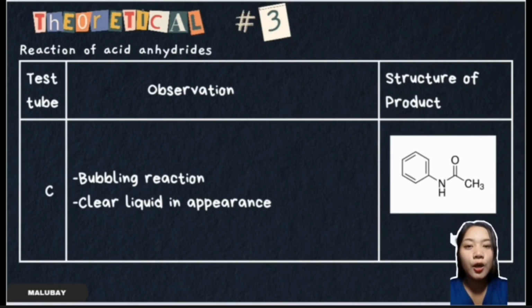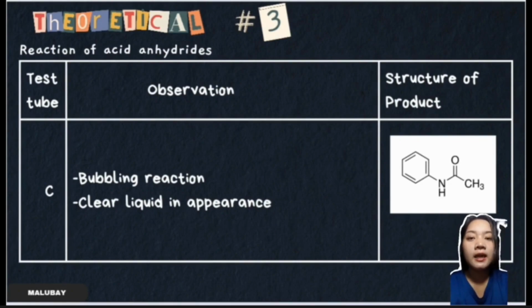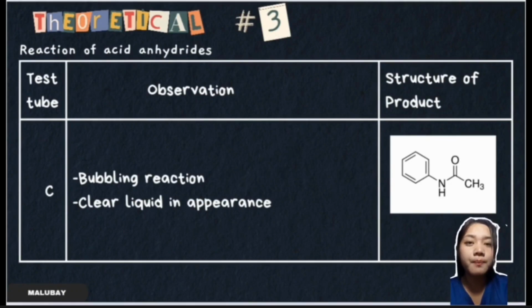In this mixture, we observe a bubbly reaction and also a clear liquid appearance. This is the structure of the product produced, which is what we call acetanilide.